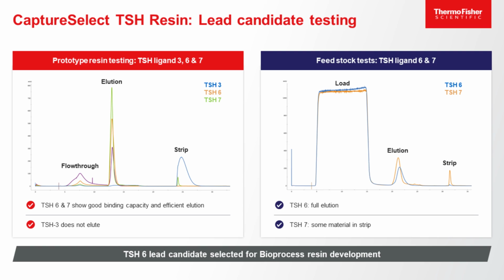And we demonstrated in this case with pure material that although all 3 ligands actually performed, we could clearly see that TSH3 had some issues with elution, which you can see on the left-hand side by the strip fraction of TSH3. And TSH6 and 7 actually showed good capacity and efficient elution.